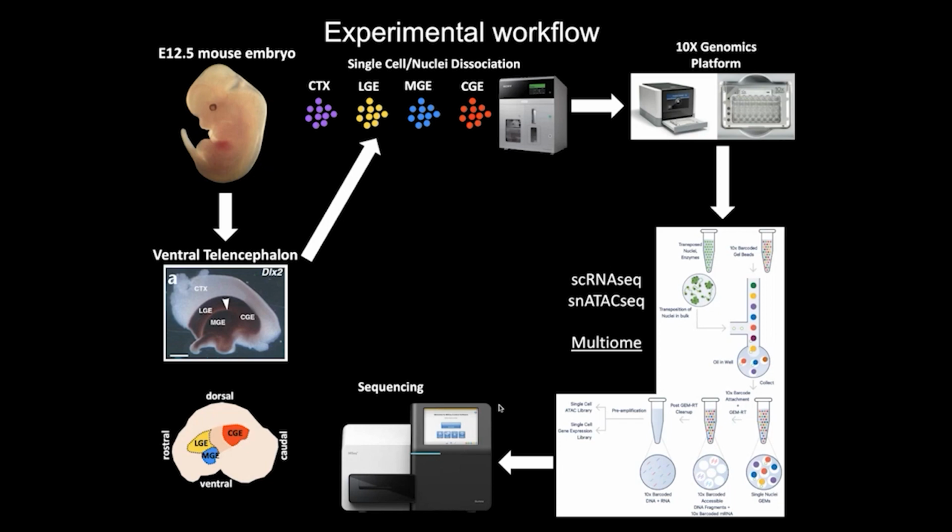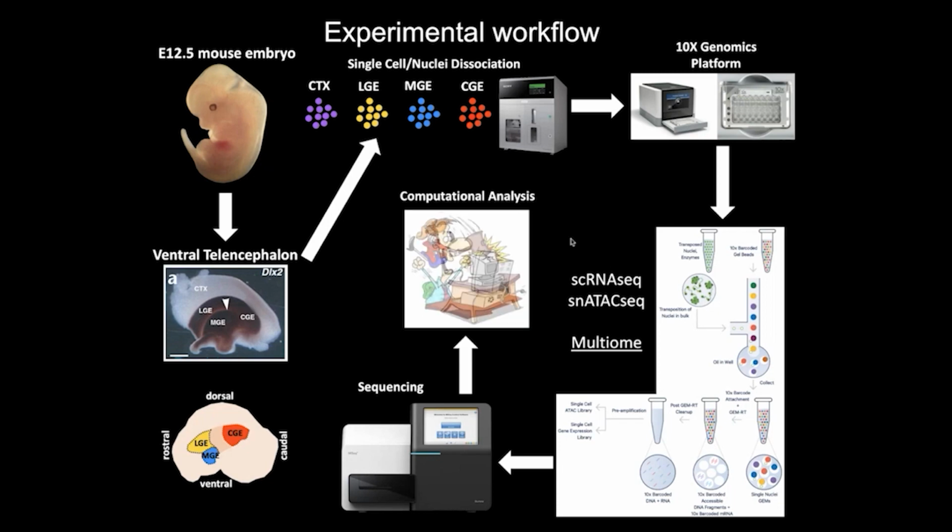We then send it to our sequencing core, and then what we spend most of our time doing is computational analysis, which, depending on the day, can be either incredibly revealing and insightful or incredibly frustrating as we try to troubleshoot various bioinformatic strategies to perform the analysis.